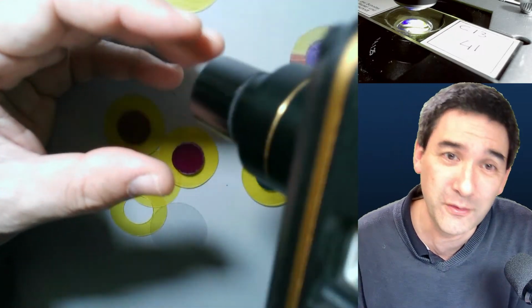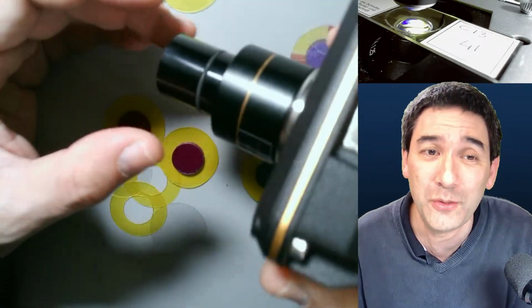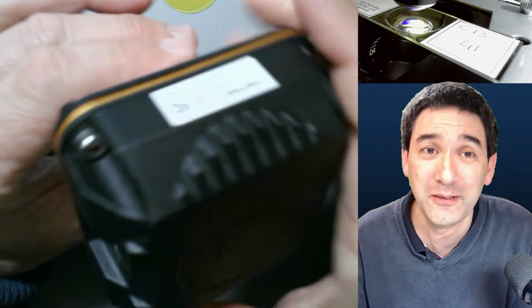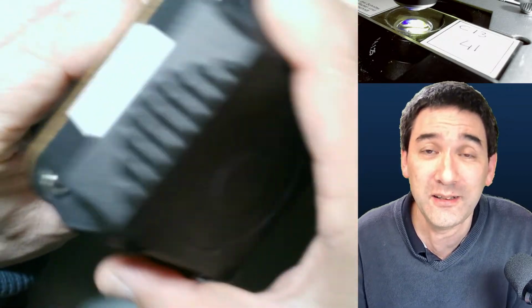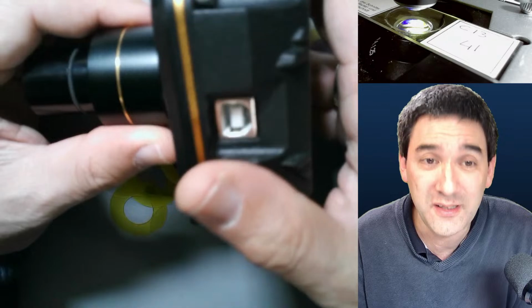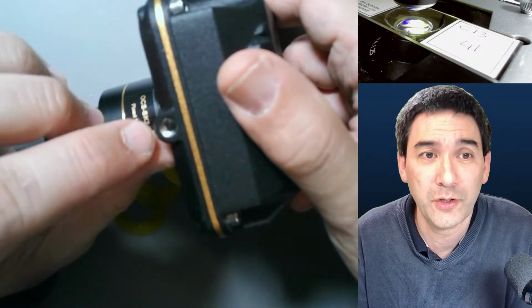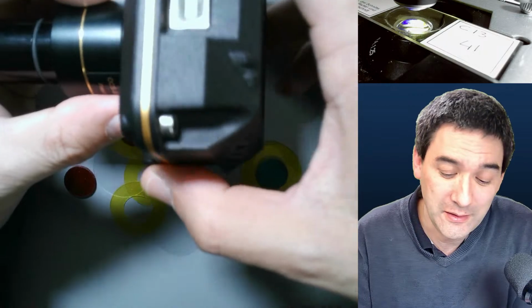All you do is drop it in. Even if you do not have a photo tube, you can drop it into the eyepiece. They're sufficiently light that in most cases the microscope won't tip over. But they too cost a couple of hundred. There's even a tripod here. So this is a little bit of a thing.